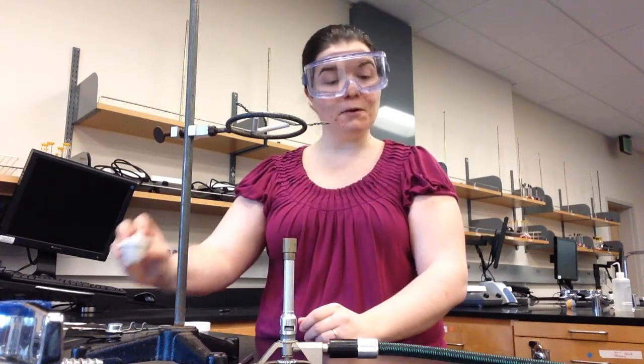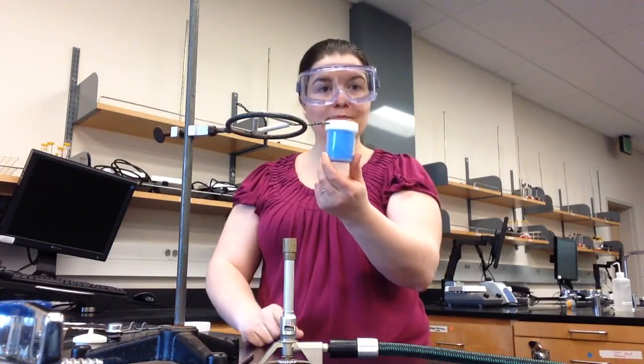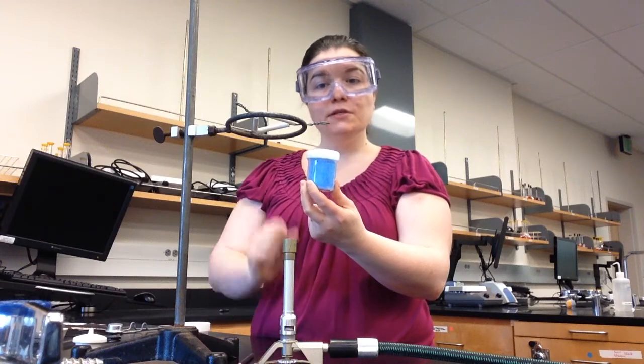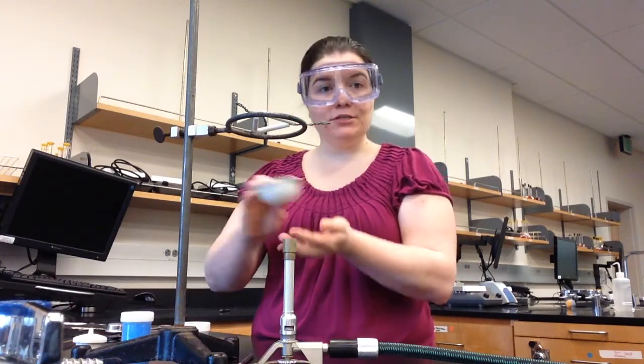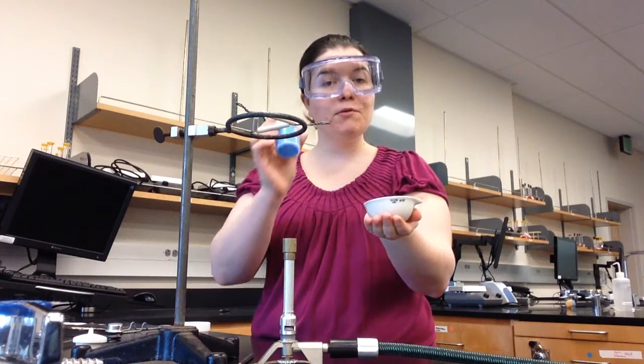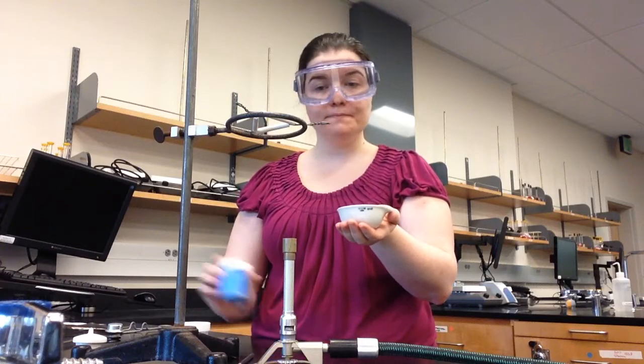The second part of part 2 involves dehydration. You're going to be dehydrating this mystery blue chemical and determining the percent water inside of it. To do that, you will need an evaporating dish. You'll measure the mass of the empty evaporating dish, then put 2 to 3 grams of the mysterious blue chemical into the evaporating dish and measure the mass one more time.